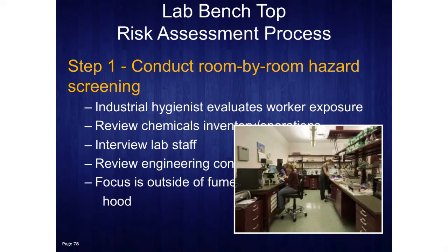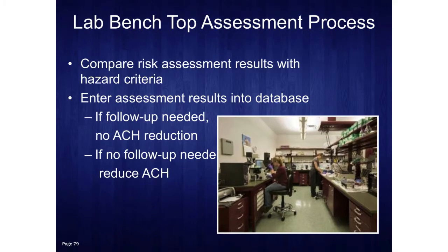And for us, step 1 is an industrial hygienist goes room to room and looks at the chemicals in use and how they're being used, talks to lab staff about all the procedures and processes that they do. They get to know the lab.